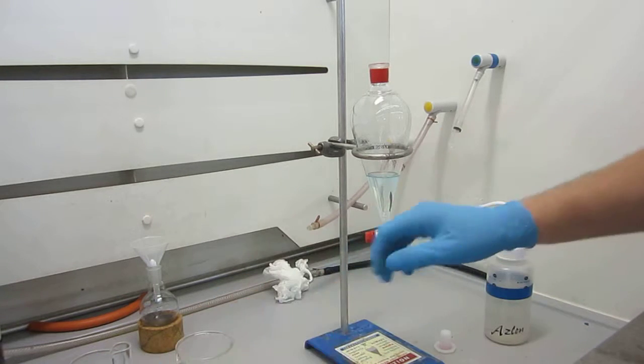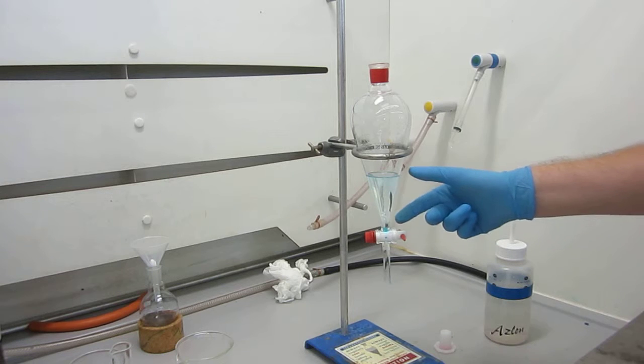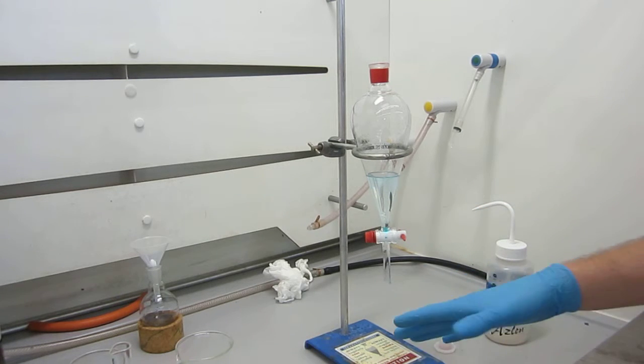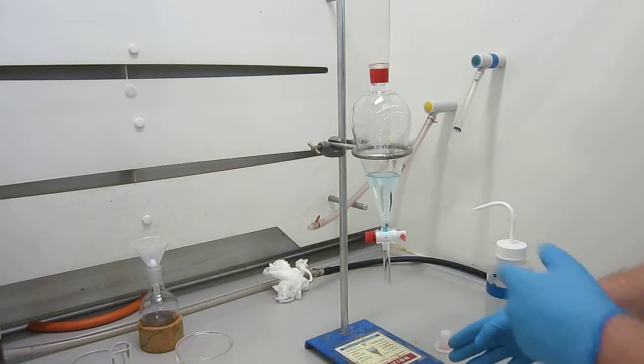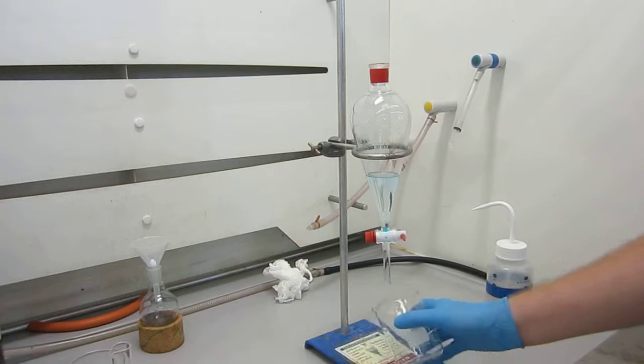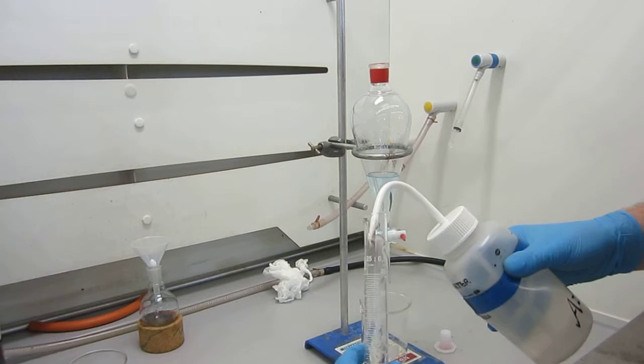If we look back, this should now just be ethyl acetate layer, and it's still got a blue tint to it. It's still got some product in there that's happy to coordinate with the solvent very slightly. But I want to get all that out. There may be about 5% product in there. So back under just in case, and another 25 ml of water.